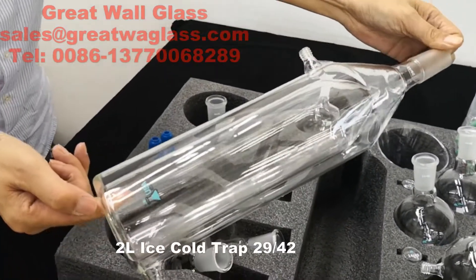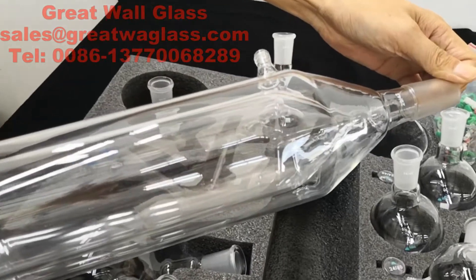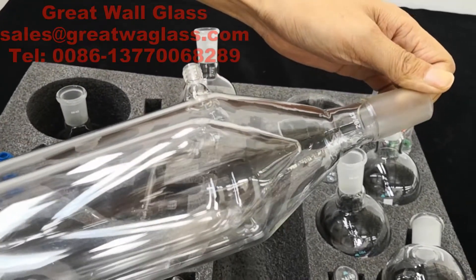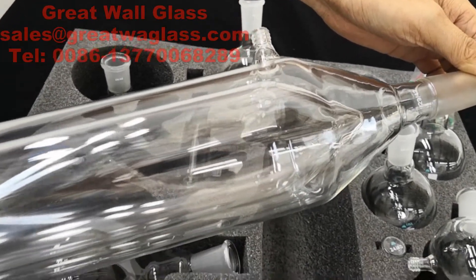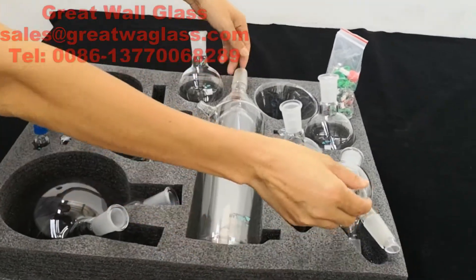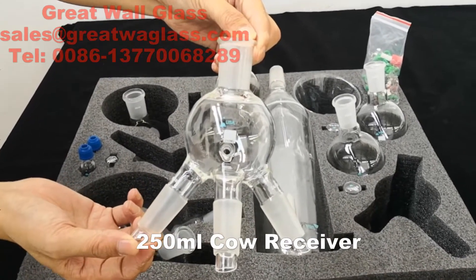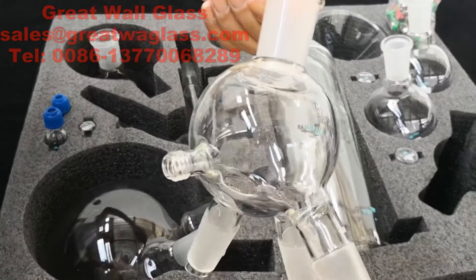One piece of two-liter cold trap. Its joint is 29/42 and its inner tube is a conical shape. One piece of three-port cover receiver with a vacuum port.